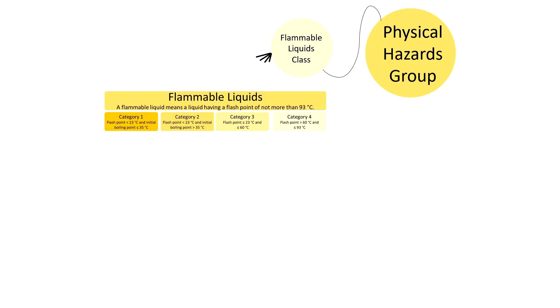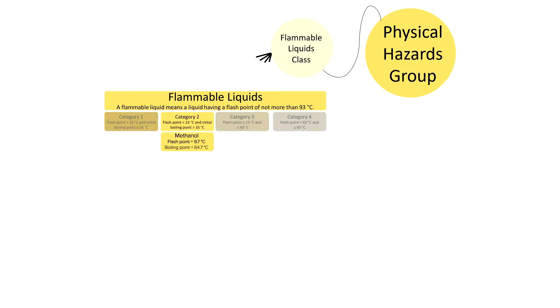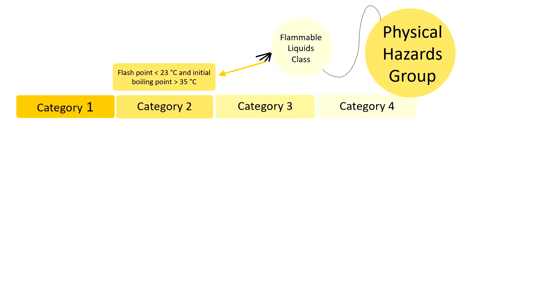This class has four categories, defined by the flash point, which is the temperature at which the vapor forms an ignitable mixture in air, and the boiling point. Methanol has a flash point of 9.7 degrees Celsius and a boiling point of 64.7 degrees Celsius. Therefore, methanol is a category 2 flammable solvent, the second most severe category for that class.